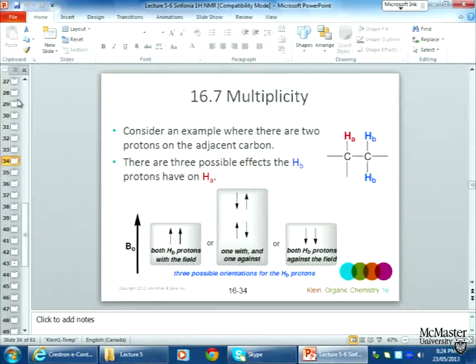If I see a resonance and it's a triplet, how many neighbors must we draw in the structure? 2, right? The only structures that are acceptable for a methyl group that is showing up as a triplet are ones that have 2 hydrogens on the carbon atom next door.